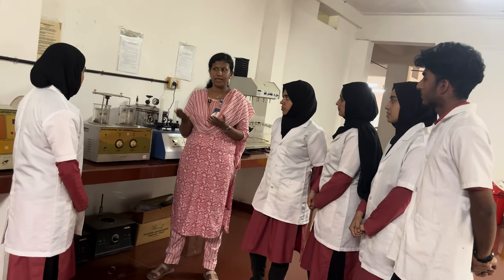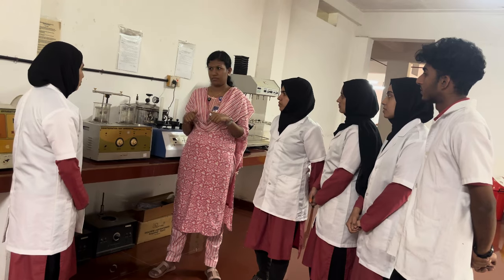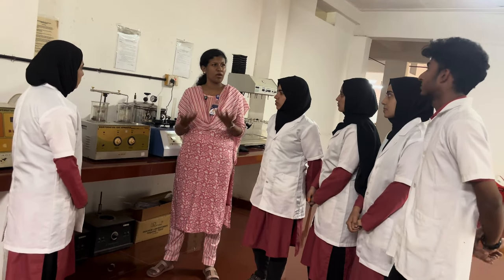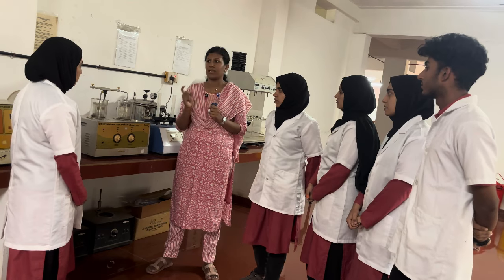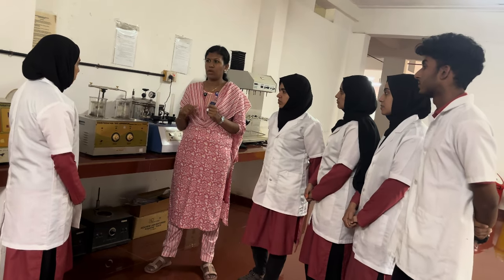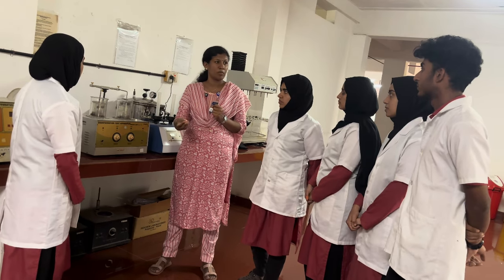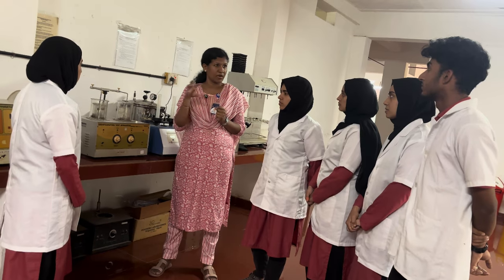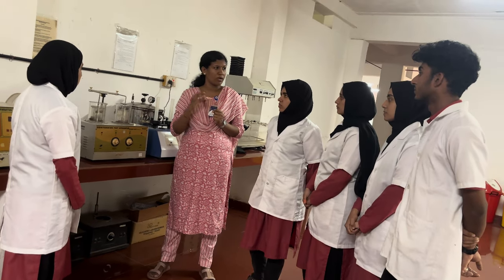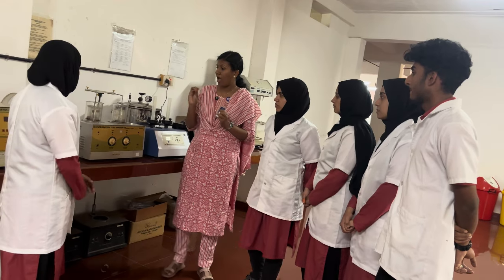So we are conducting the disintegration test for tablets which are swallowed, because after swallowing we cannot measure the disintegration. So that's why we are conducting the disintegration test only on swallowed tablets, not on chewable tablets, or on the tablets used to prepare solution, or tablets used vaginally. There are different categories of tablets. So for swallowed tablets we are conducting the disintegration test. Clear? Okay. Then how can we conduct it?